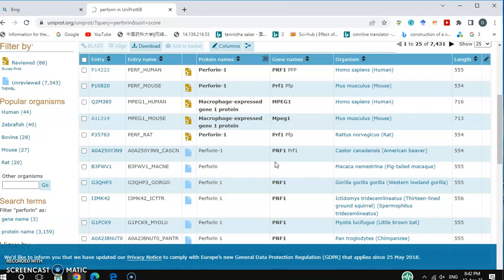And second, in most cases you find your 3D structure from UniProt or the PDB database, but in some cases you cannot find your desired structure. In that case you have to build your 3D structure by using the Swiss model. So that is the second reason.